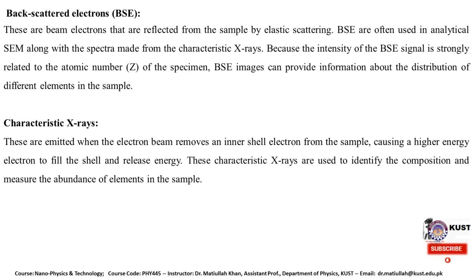And the third process that occurs due to the collision of the primary electrons with the samples is the characteristic X-rays.